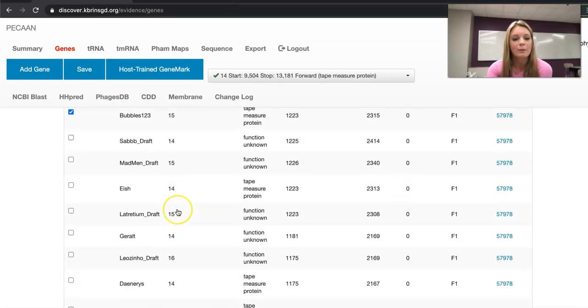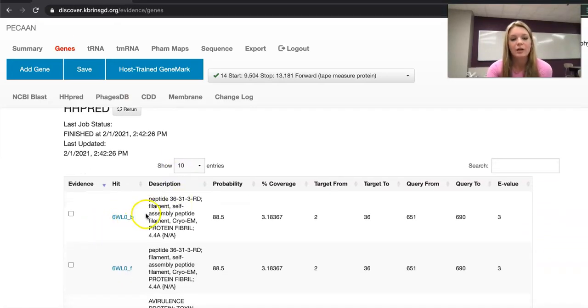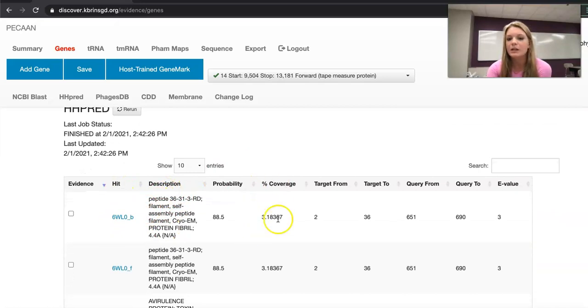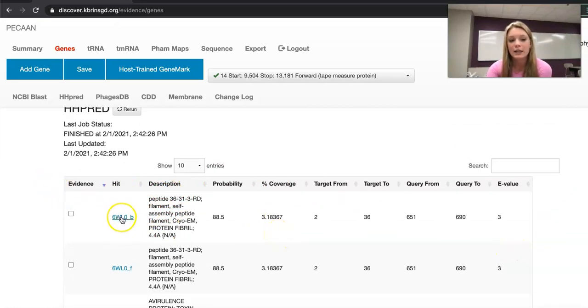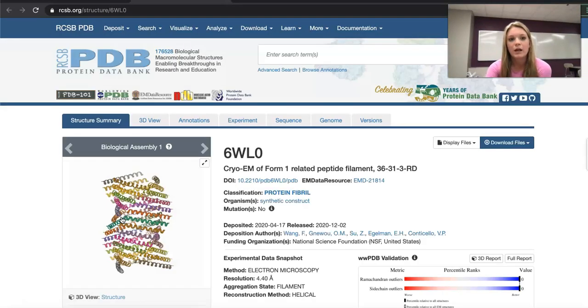Going back to HHPred you have the description, the hit, the probability, the percent coverage, and the e-value. Clicking on this hit link is going to take you to the protein databank.